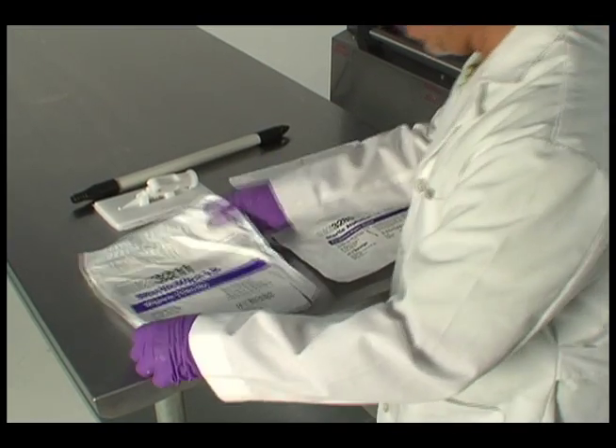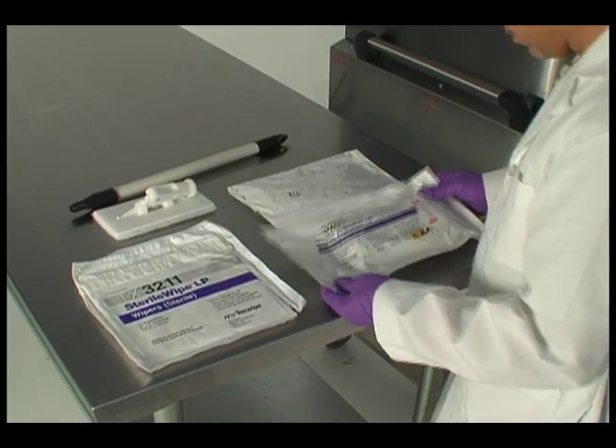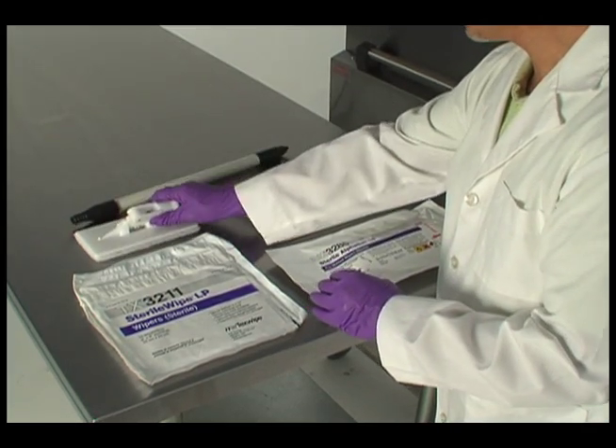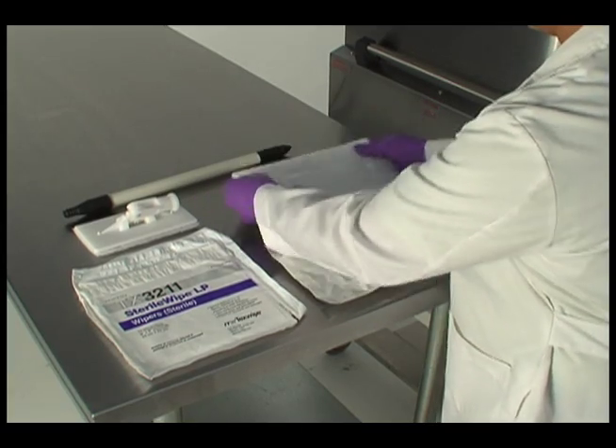Cleaning should be completed with a facility-approved disinfectant and disposable lint-free or low-particulate release cleaning cloth. NuAir has supplied all new PharmaGuard units with an isolator cleaning tool to help improve access to hard-to-reach areas.